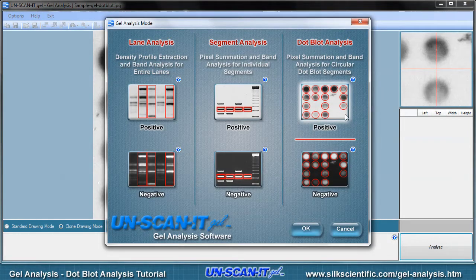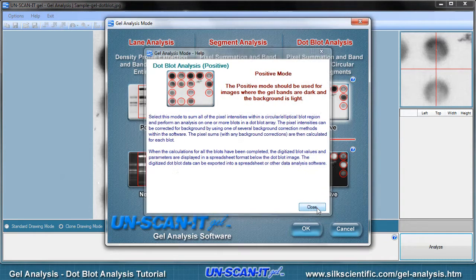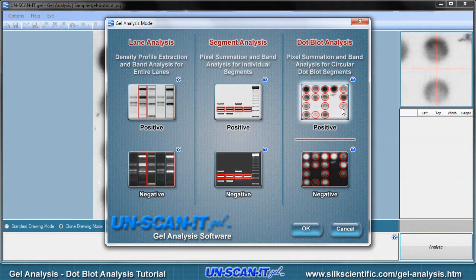There are several gel analysis modes available including Lane Analysis, Segment Analysis, and Dot Blot Analysis. These modes are explained further by clicking the question mark button associated with each mode. For this tutorial, we will choose the dot blot analysis mode.